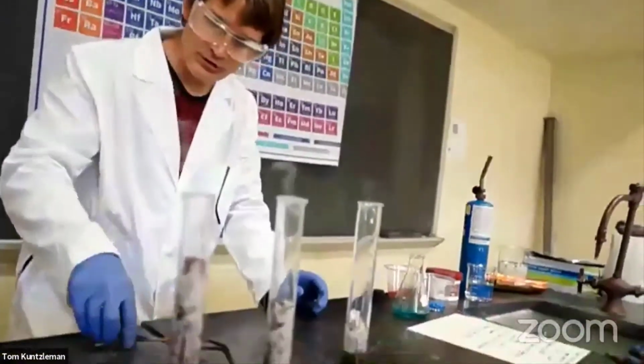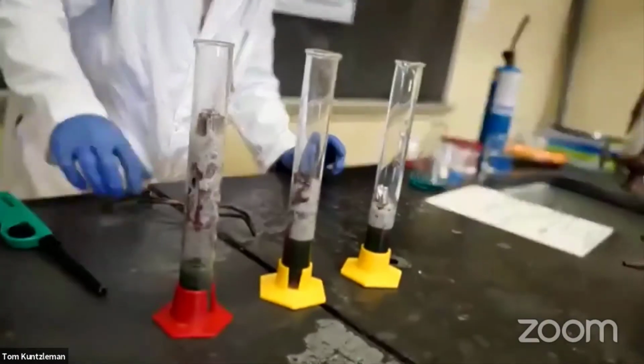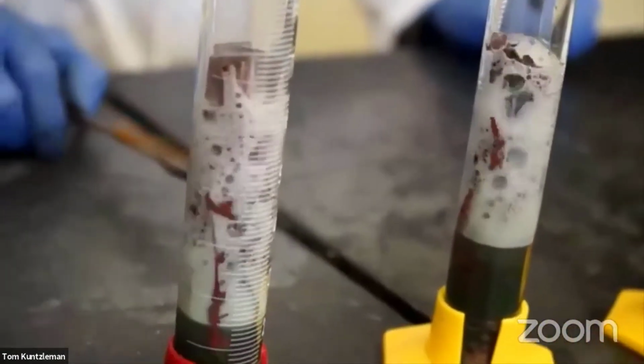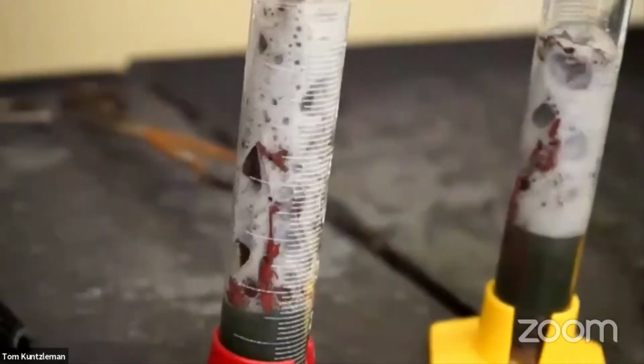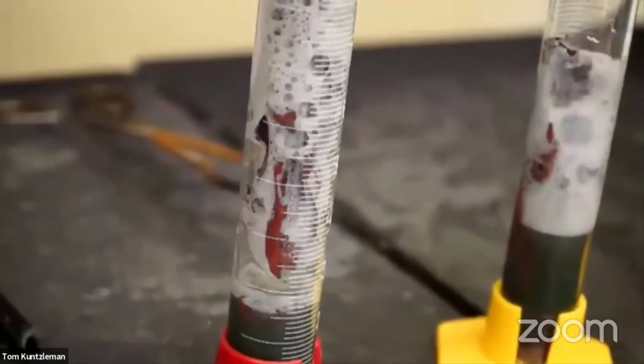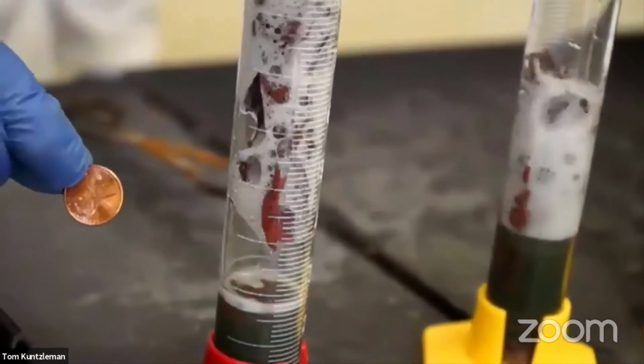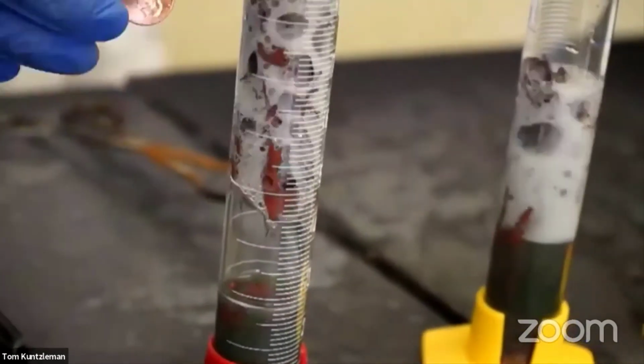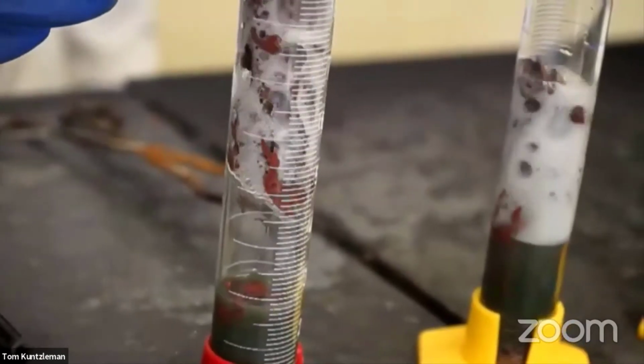So if you look closely, you actually might notice that the color of that stuff that looks like rust, you know what? It kind of looks like the color of a penny. Maybe an old penny. It's a little bit reddish, isn't it? A little bit orangish. But yeah, it's the color of a penny.